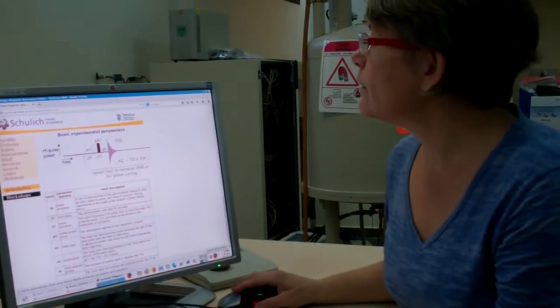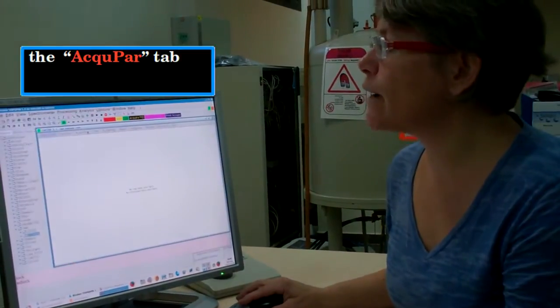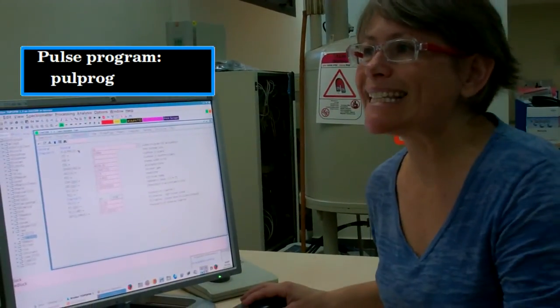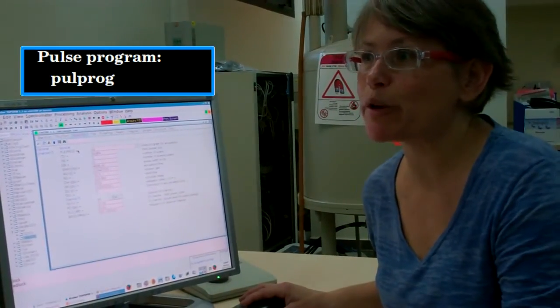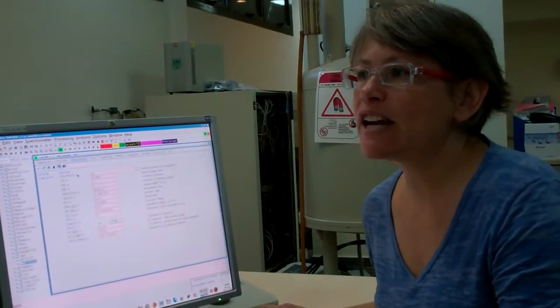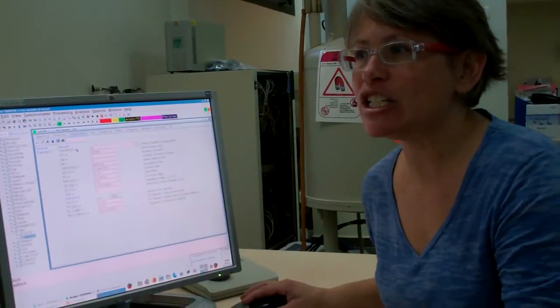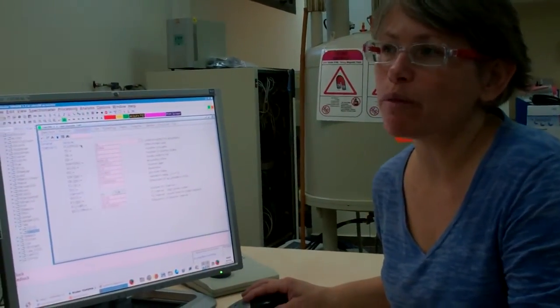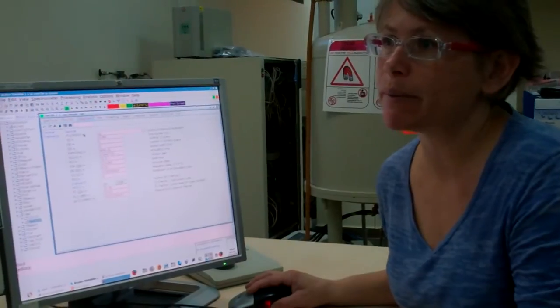Now we'll jump on in by clicking the acquisition parameters button. The first parameter on the menu is the Pulse Program. This is a set of instructions telling the spectrometer when to wait, when to pulse, and when to acquire. The standard Bruker file, named ZG, contains the spectrometer's instructions for the basic Pulse Acquire NMR experiment.